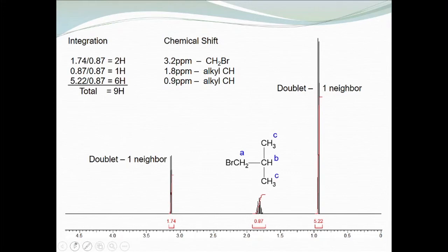If 2 sets of hydrogens show up on the same peak, give them the same label. So we have one peak here at the 0.95. It represents both methyl groups. And so we give them the same label because they are represented by the same peak. When you get into Organic 2, you will learn about equivalent nuclei, and you will label them accordingly. But for now, if they're from the same peak, give them the same label.